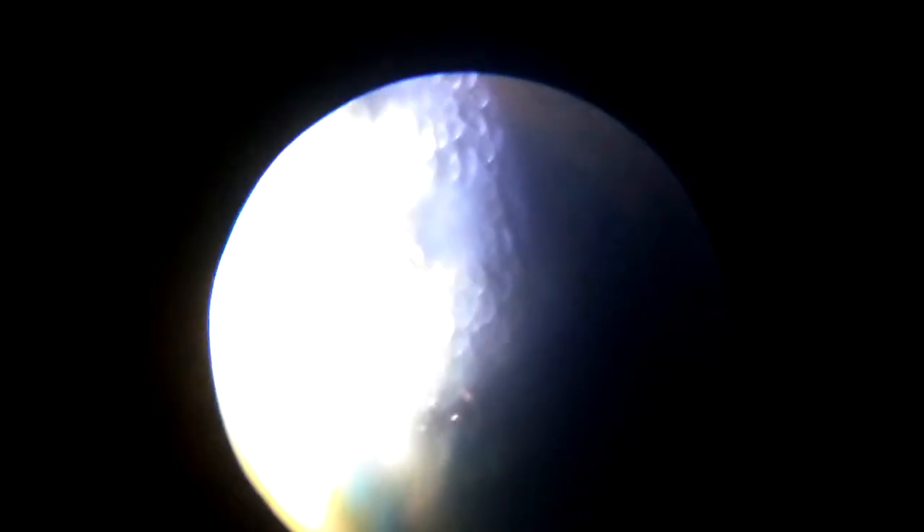This is the transverse section of a Carica papaya leaf stalk. You can see the xylem and phloem are arranged in a ring manner, because the entire leaf stalk is hollow from the inner side and only the ring-like structure is visible. Collenchyma tissue is also present, with parenchyma around it.